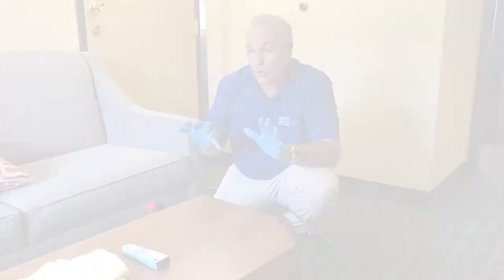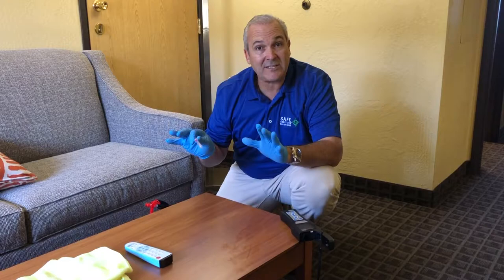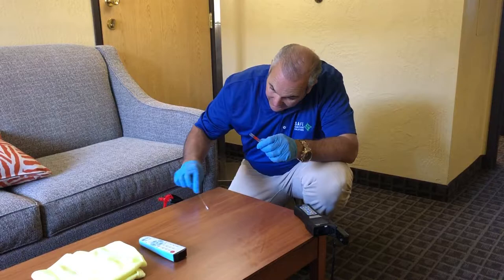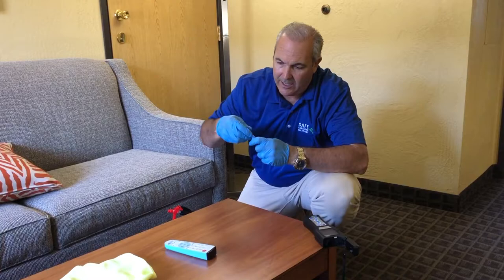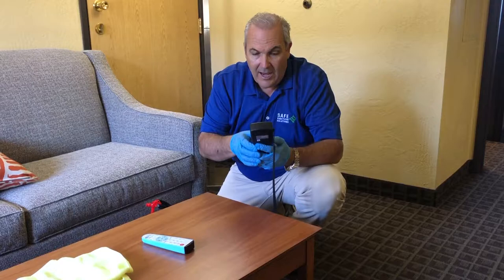So we had our dandelite product on the table for one minute. I've already done the wipe down — I wiped down the remote. We're going to take and do the same test on the surfaces in the same spot, and let's see what kind of reading we got. The beautiful thing about the dandelite is it's so safe and so easy to use, and that's what's so amazing about the product — it cleans.